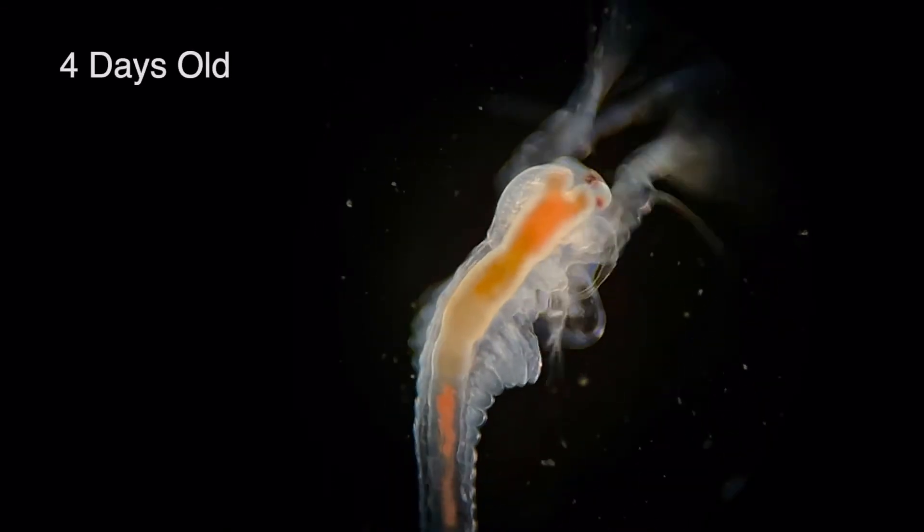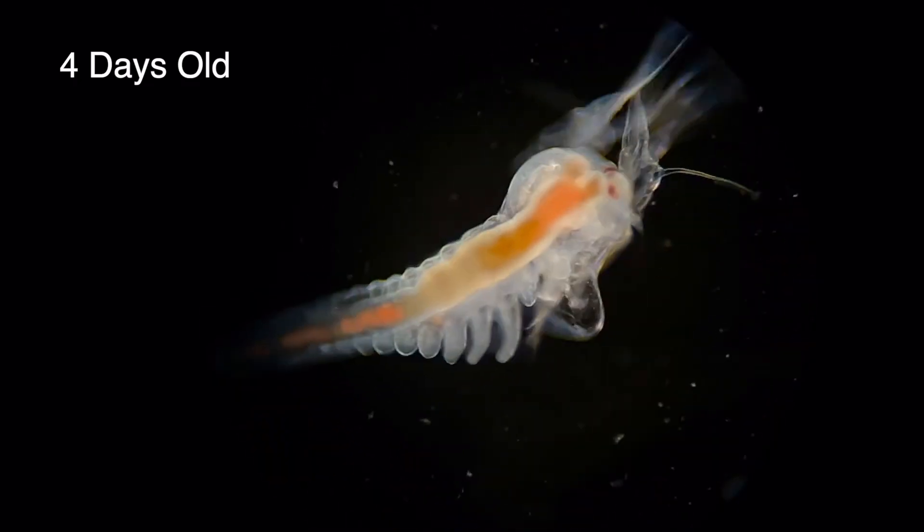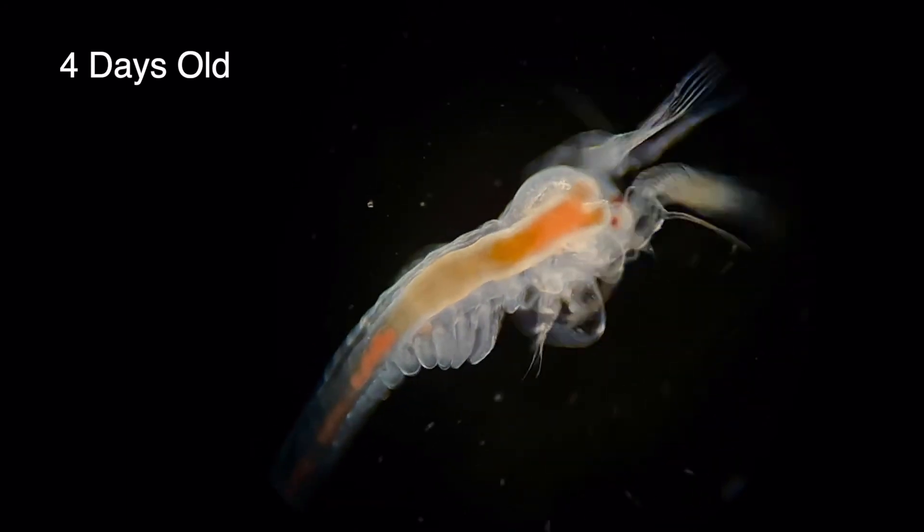At this next phase the body's got considerably larger and longer. Have a look closely at those ridges that have begun forming along its thorax — that's the beginning of their leg development, which are called thoracopods.